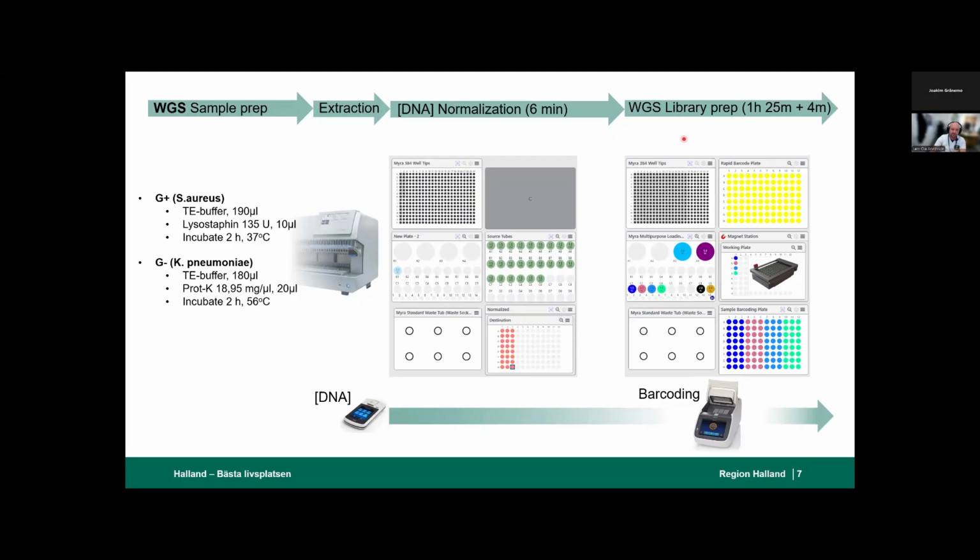In this example here, I just wanted to show you the upper limit of what can be prepared, which is 96 samples divided over 4 libraries. This will require larger amounts of ethanol to wash, and also a larger waste disposal, which are these over here. And that's why they are bigger than what they were in the previous setup.